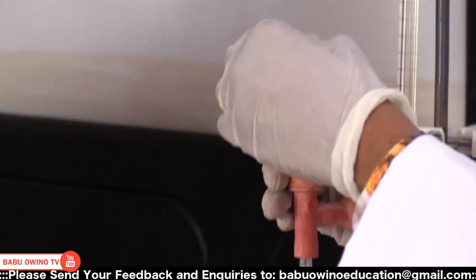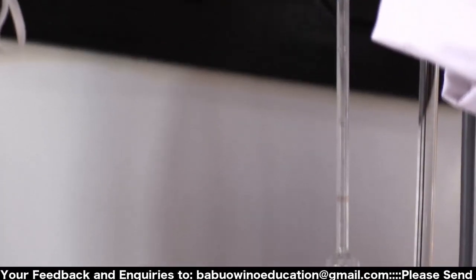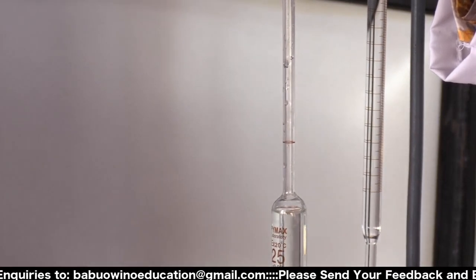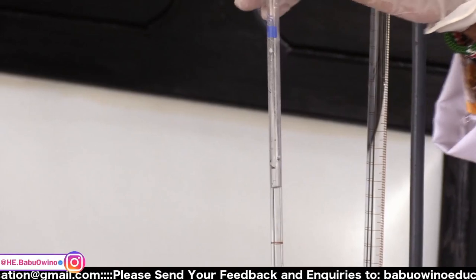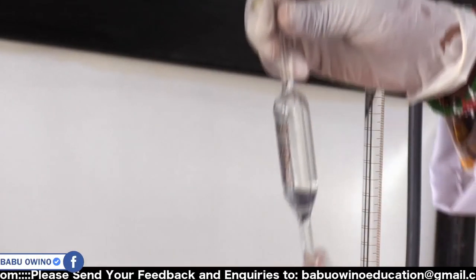So you feel it. When you see that it's taking some little time, again release here. Then you press simultaneously. Then again you refill it, you feel it. You press hard, use a little energy. Make sure you pass the mark. Then after that, release up to the mark.